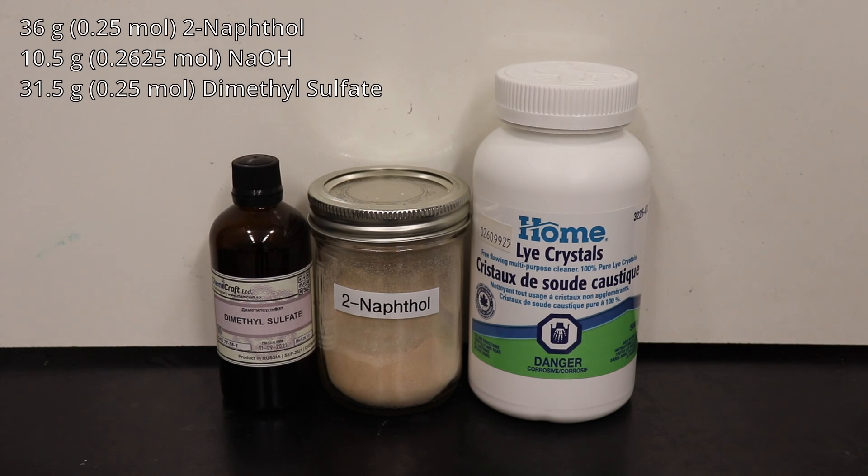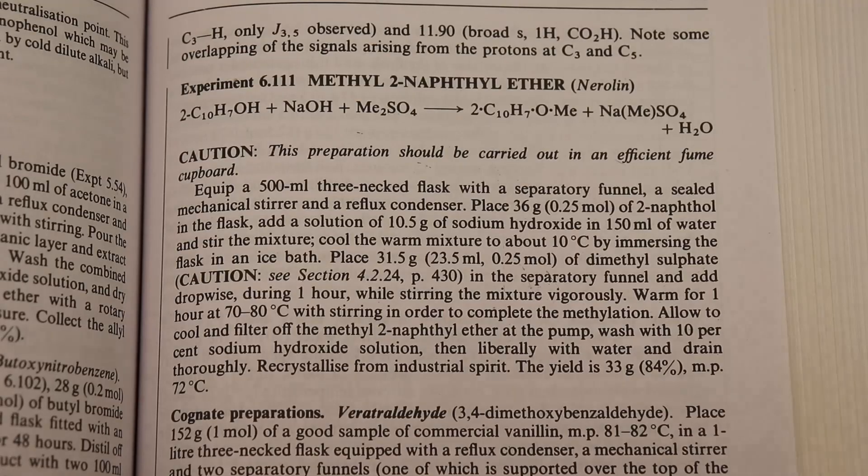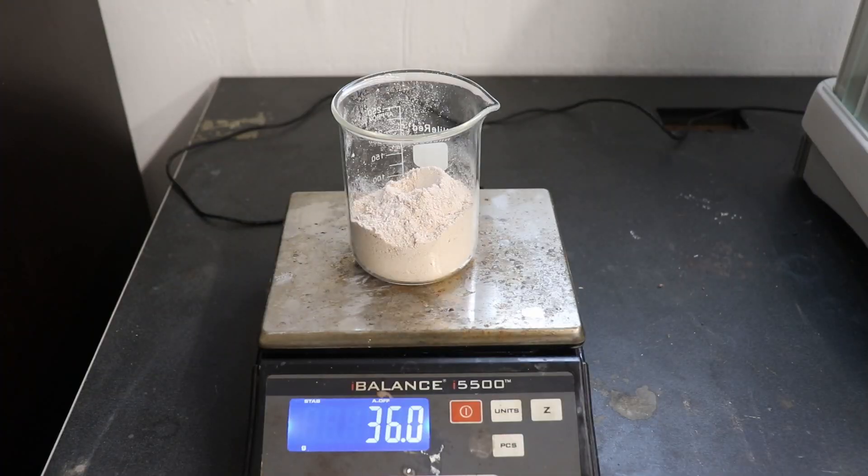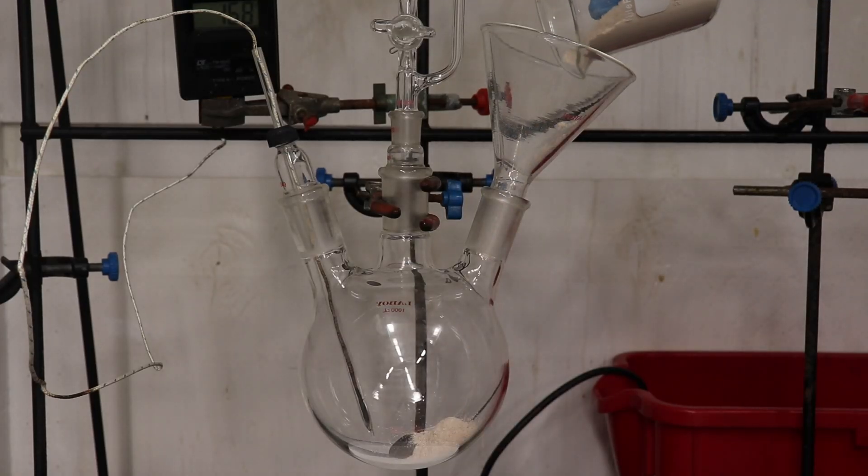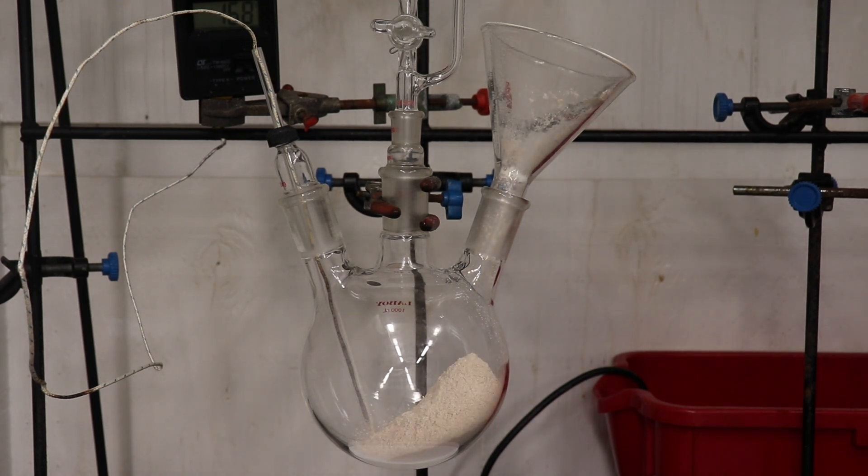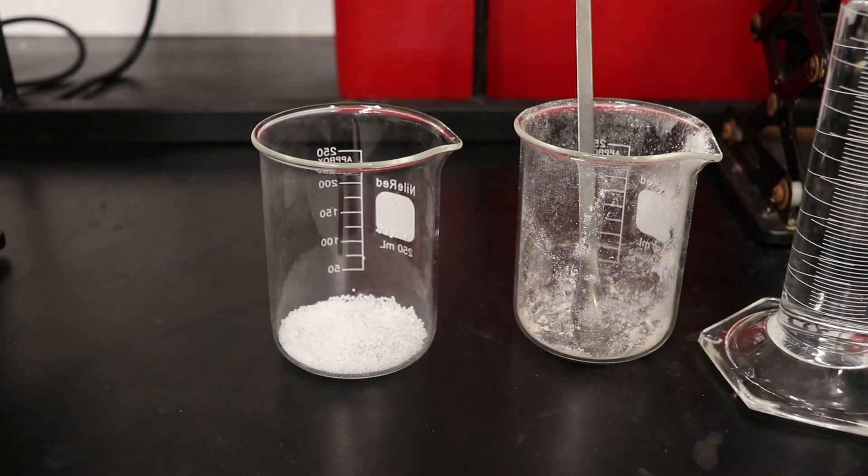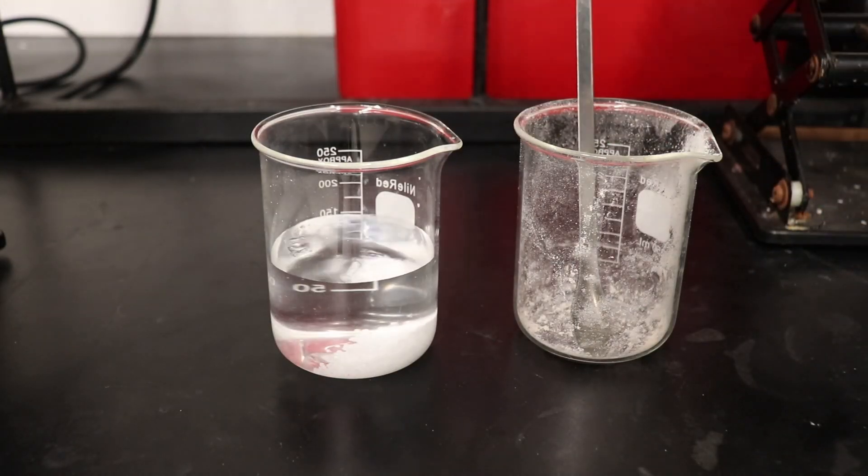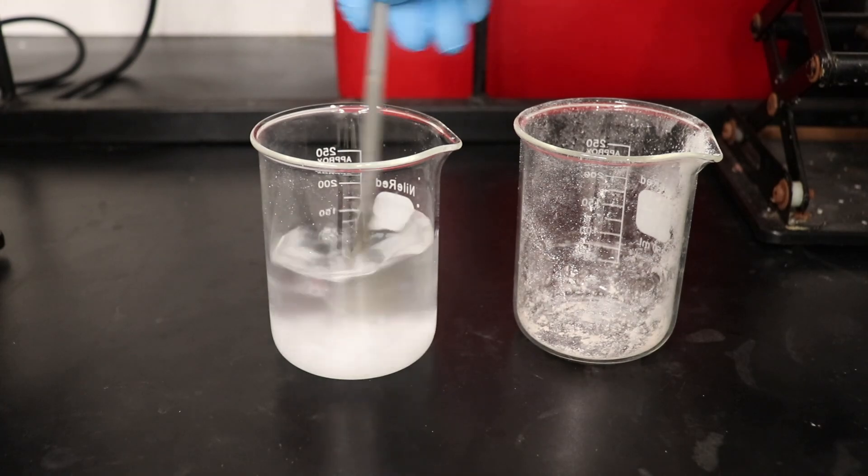To begin, I'll be showing the preparation with dimethyl sulfate on the 2-napthol that I prepared in the previous video. I am following the procedure as laid out in Vogel's Practical Organic Chemistry. 36 grams of 2-napthol was measured out and added to a 3-necked 1-liter round-bottom flask with a thermocouple probe and addition funnel. Then a solution was prepared with 10.5 grams of sodium hydroxide in 150 milliliters of water.